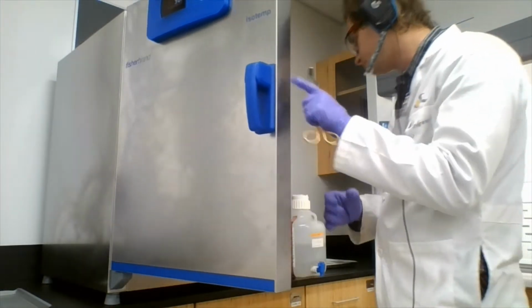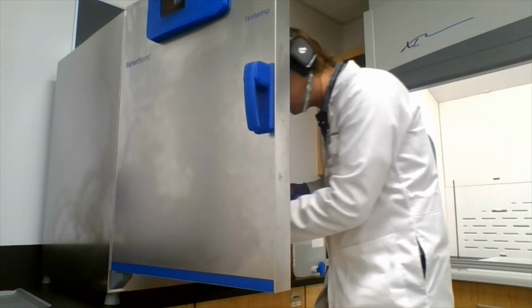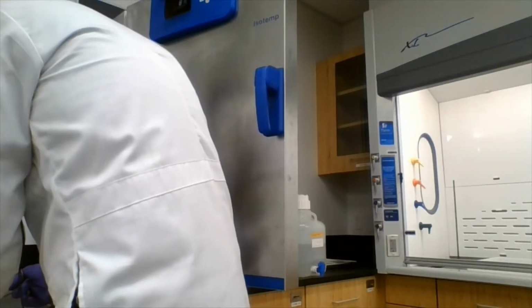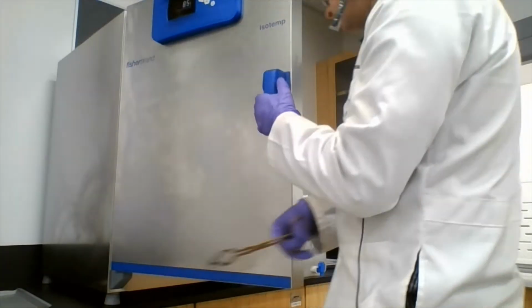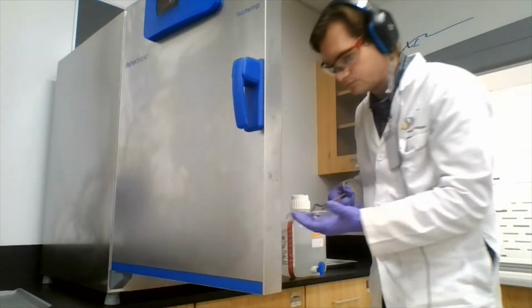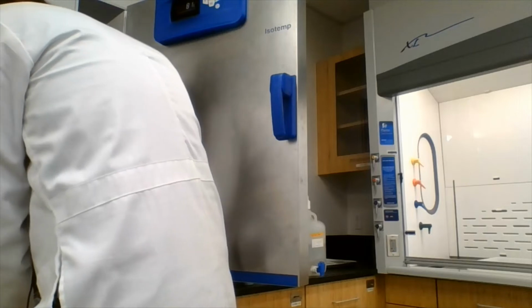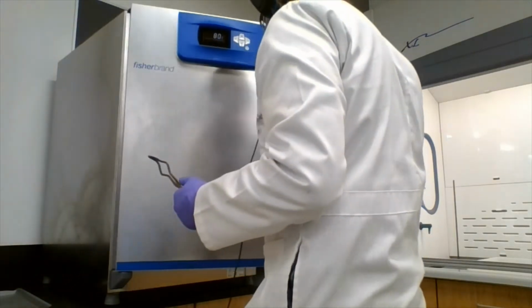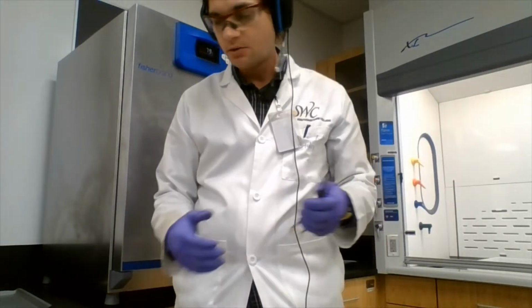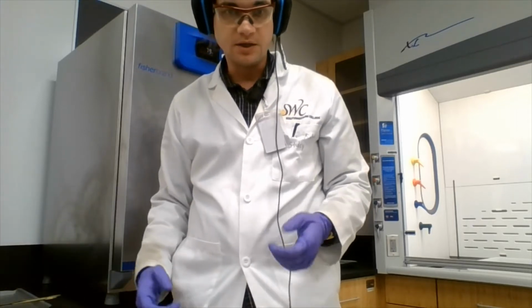Open this up and bring them out. One, two, and now I'm going to wait a few minutes while they cool down and then get their mass.